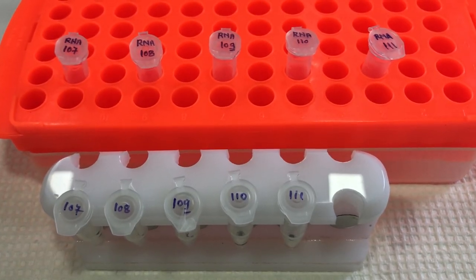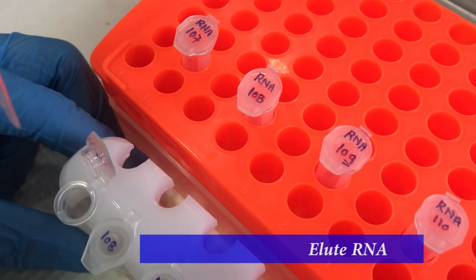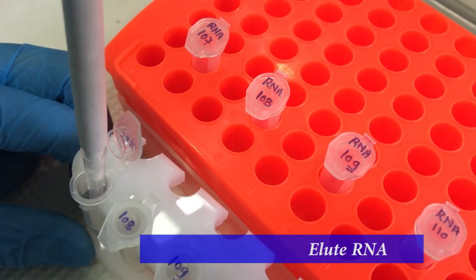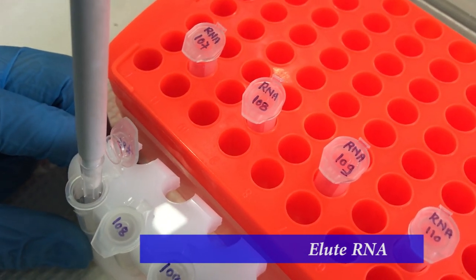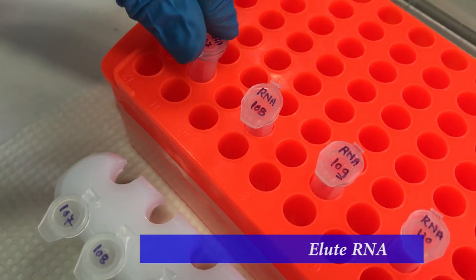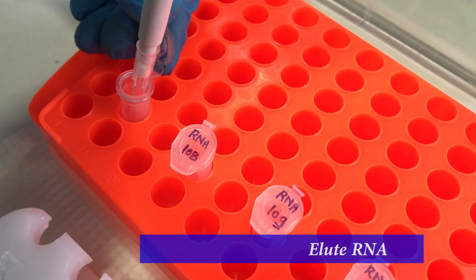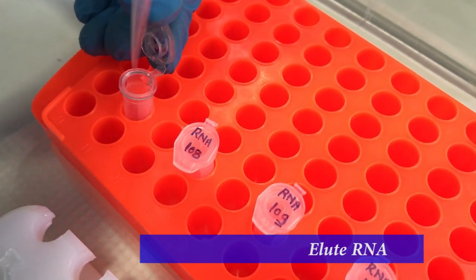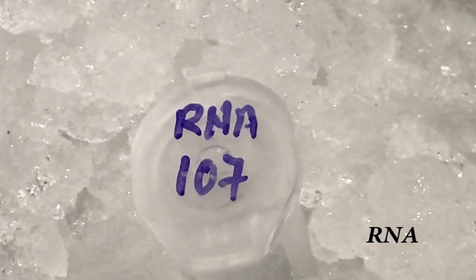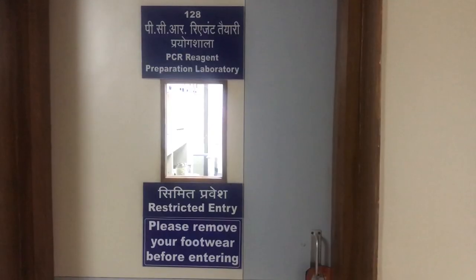Allow the magnetic beads to settle on the magnetic stand for 3 minutes and later remove the RNA carefully, without disturbing the beads, into a freshly labeled 1.5 ml Eppendorf tube. Keep the eluted RNA on ice or store it at minus 80 degrees for future use.